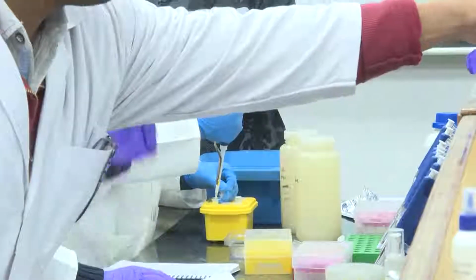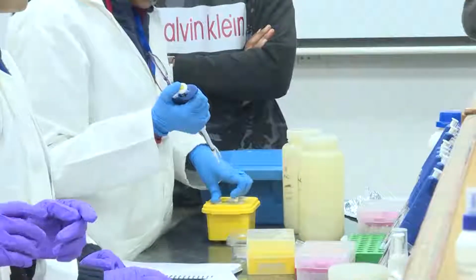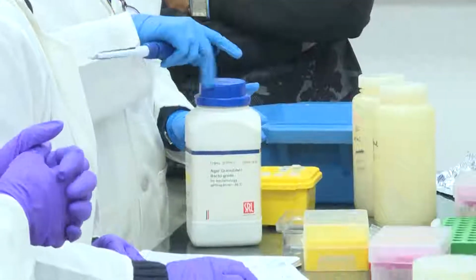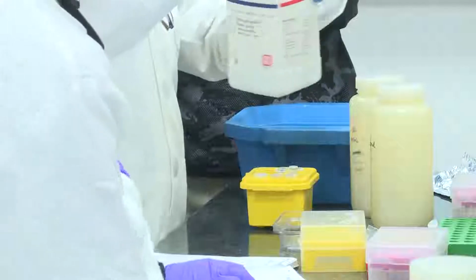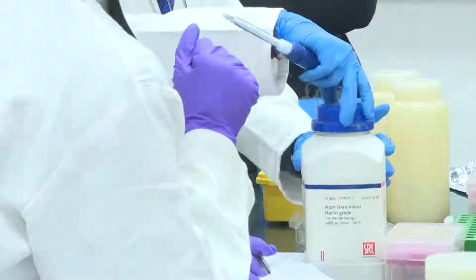Okay, the other issue I want you to learn is, what is the cost of a real-time PCR machine? 8 to 9 lakhs. What is the cost of a normal PCR machine? 3 to 4 lakhs. So you should be aware of this cost factor, because when you say 8 to 9 lakhs, it may have certain features, and you may not be able to extend certain other functions.